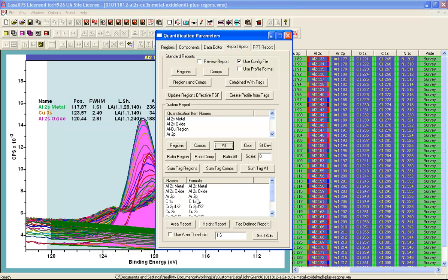So now I have a set of names and formulae. The formulae are the names for the regions or the components that are defined on these data and they have been gathered from the selected VAMAS blocks. To create the profile I press the area report.